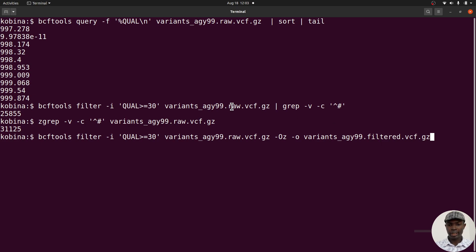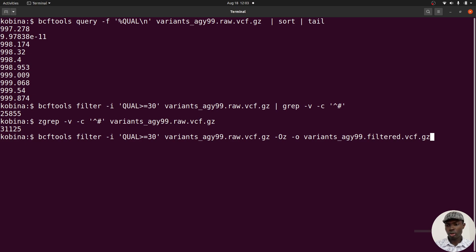Notice the naming convention: the downloaded file was AGY99.raw.vcf.gz (raw VCF), and the output is named .filtered.vcf.gz. Always use a good naming convention that includes a description — 'raw' tells you it's unprocessed, 'filtered' indicates processing has occurred. This helps you track your data, keep files organized, and even enables batch processing with wildcards when you have thousands of VCF files.